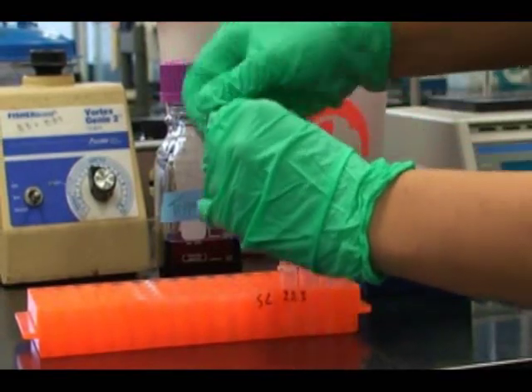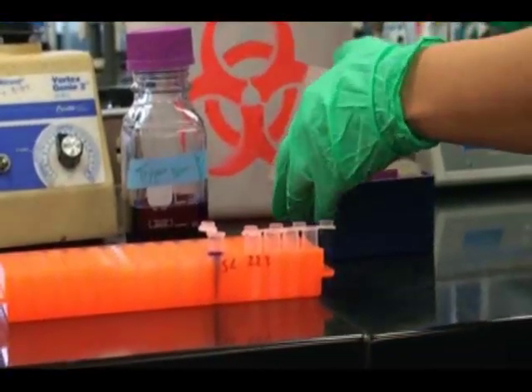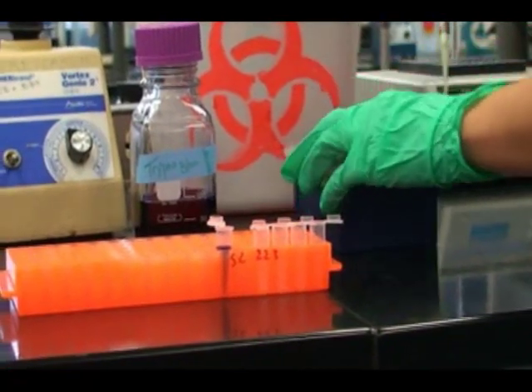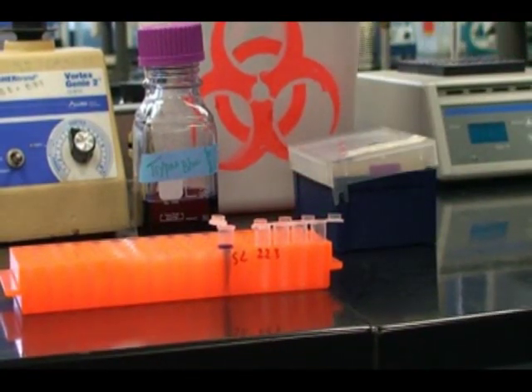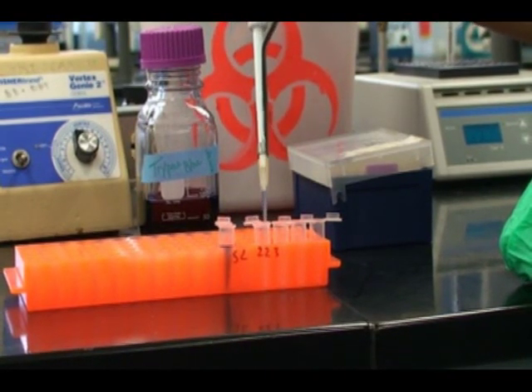Open the first tube with a 1 tenth or 10 to the negative 1st dilution. Then with a new pipette tip, pipette 100 microliters from the 10 to the negative 1st dilution into the second tube to make your 1 hundredth or 10 to the negative 2 dilution.